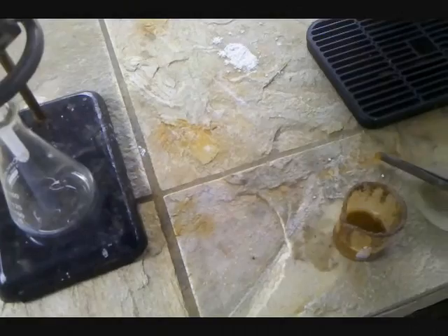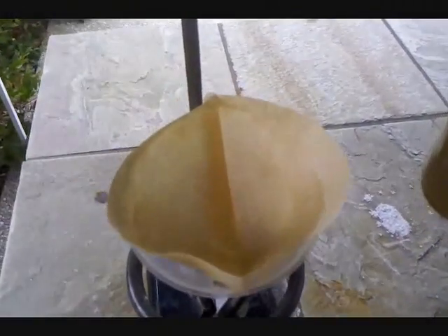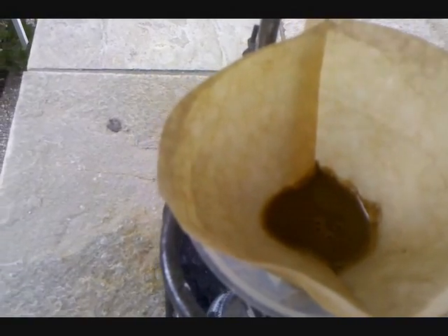Now the reaction between magnesium and the chloro-auric acid is done. Filter your gold slurry, let it dry, and collect the gold particles. Here's the gold powder I collected after filtering — you can see I have quite a bit. Now I need to melt it into one piece, which is going to be the harder part because gold melts at about 1000 degrees Celsius.